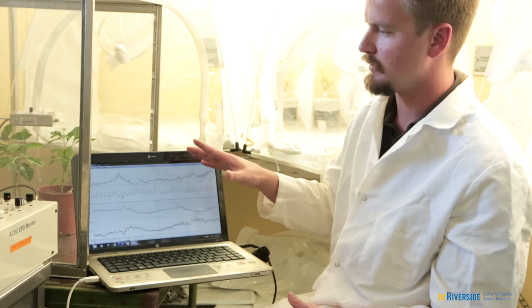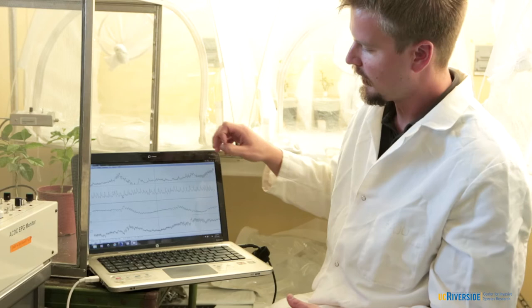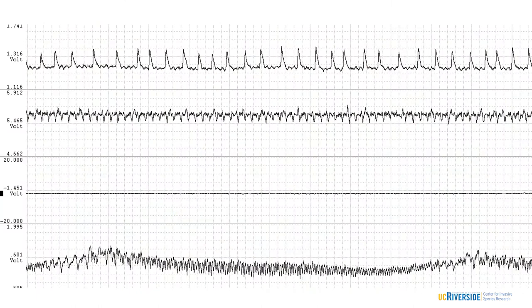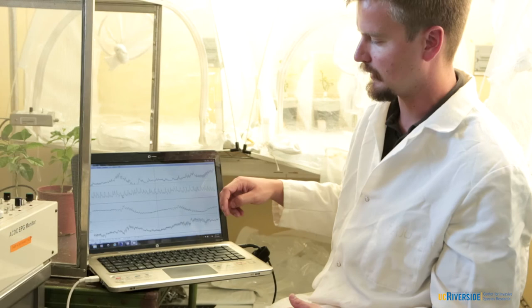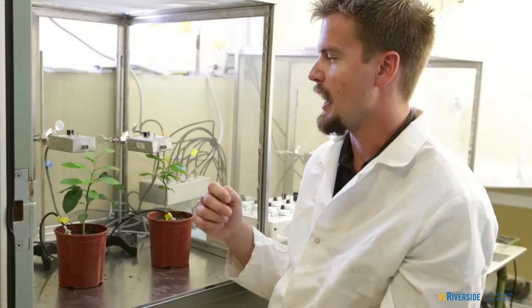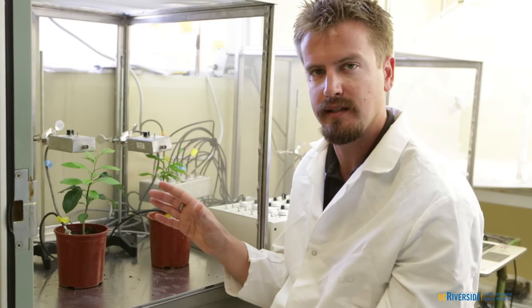So once we've hooked up the Asian citrus psyllid and made it part of the circuit in the electrical penetration graph system or the EPG, this is the readout we get on the screen. So these are waveforms that have been collected from the psyllids that have been feeding during a set amount of time. And you can see here there's some different patterns that are formed. And I can then go back through and interpret those and I can see whether or not the insect actually made it to the phloem, how long it was in the phloem, or from whatever other types of tissues the insect may have been feeding from during that time.